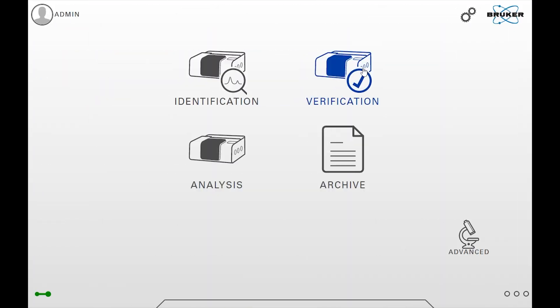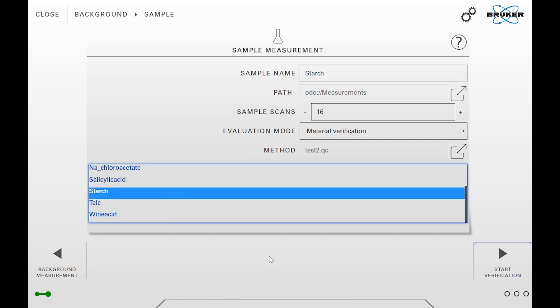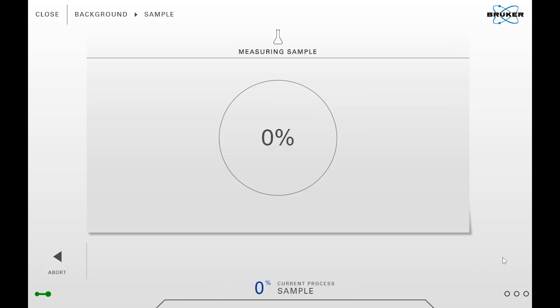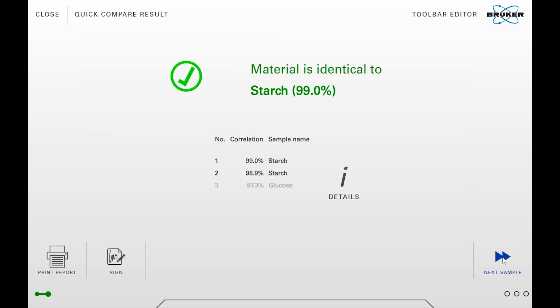The dedicated Opus Touch verification workflow provides the most convenient way to apply quick compare methods in daily routine analyzers. Of course, the method can also be used for data evaluation within Opus.